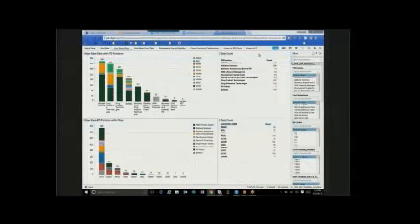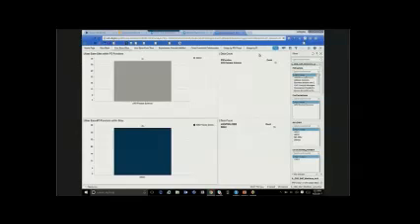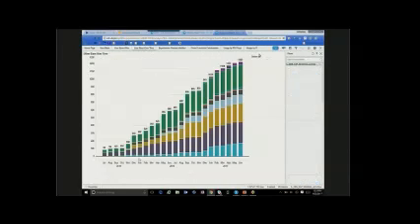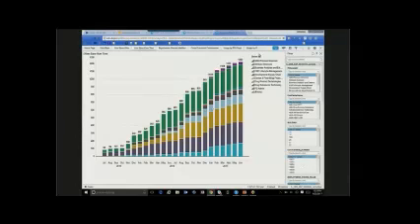The third part, business intelligence. I wish there were some managers in this room seeing this. This is all the data that actually feeds into that. We can see exactly how many experiments were created at each site. And you can definitely focus on any particular site or period of time and see that. This shows the growth in the number of users in our system. We started deploying in July 2015. Small group, now we actually had over 1,200 users in June. Now we're over 1,300.